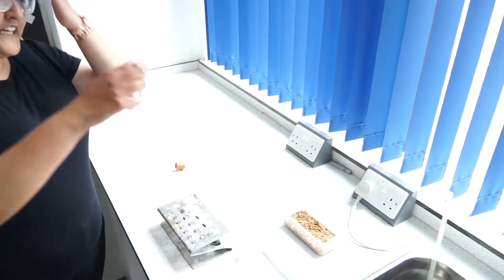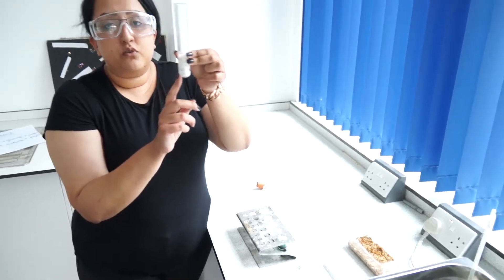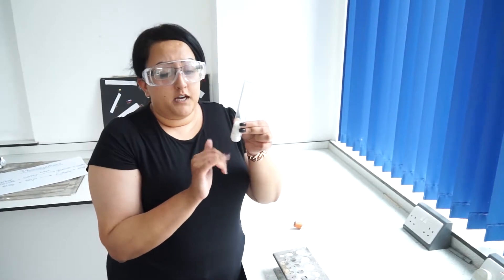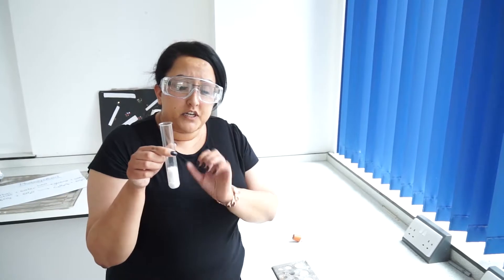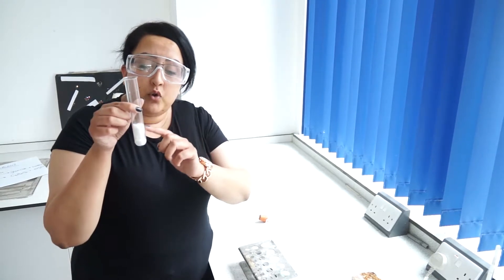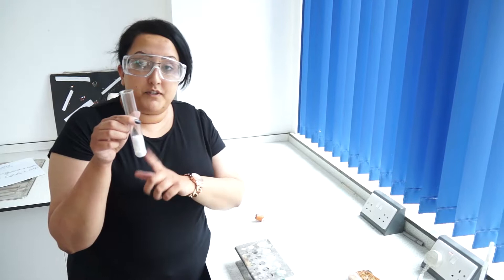In your boiling tube there is a chemical called soda lime at the bottom. Soda lime absorbs carbon dioxide from the atmosphere. You must not touch it — it's very corrosive. This will be set up for you. If there is any breakage, tell your teacher straight away and wash your hands. The cotton wool on top protects you and the organisms from the soda lime.